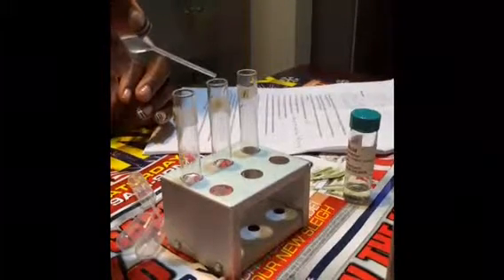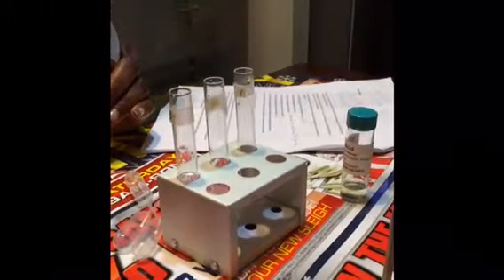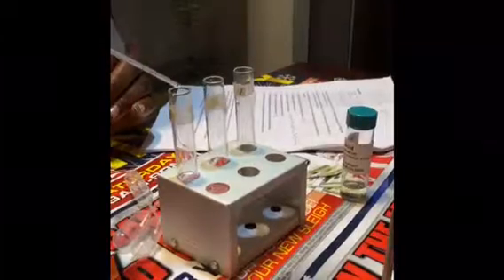Counting 20 drops again for the next tube. Oh gosh, that's like 3 drops. Continuing to 20. Okay, 20 drops of water in each test tube. Now I'm gonna agitate again. Mix.